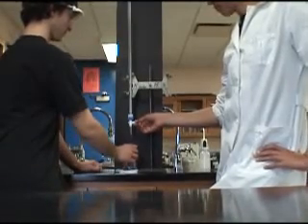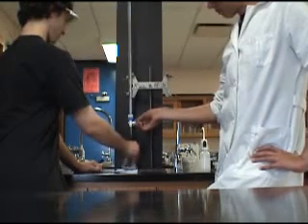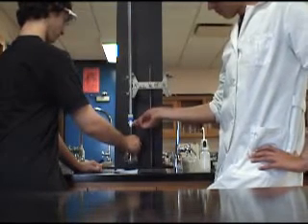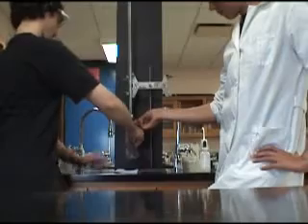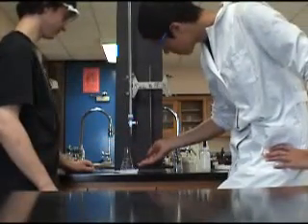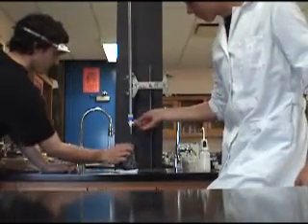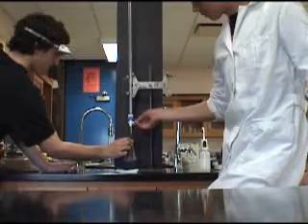You are now ready to titrate. Slowly open the valve on the burette, which will allow the NaOH to drip into the flask below containing hydrochloric acid. Make sure to do this in minute increments, as you do not want to over-titrate. Make sure to swirl the flask while titrating in order for the hydrochloric acid and the NaOH to fully react.